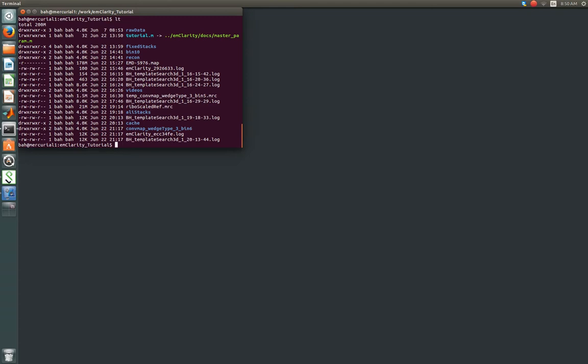You'll see two new directories, a cache directory which has the tomograms EMClarity reconstructed in order to do the template matching, and also this folder that's prefixed with combmap, which stands for Cumulative Convolution Map.